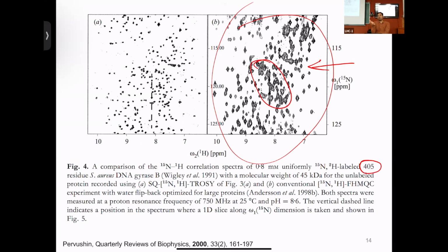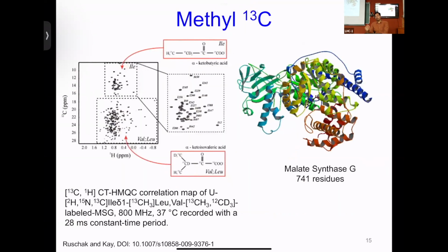So therefore, what do you have to do? You have to do 3-dimensional NMR experiments. 2D also doesn't suffice, so people can keep on building 2D, 3D, 4D, and so on and so forth. Alternatively, people can also come up with some techniques which improve resolution. There's an experiment called TROSY. For the same system, you see that the resonances are much sharper. Okay. With that, I would like to stop, where you can also see that for a much larger protein.